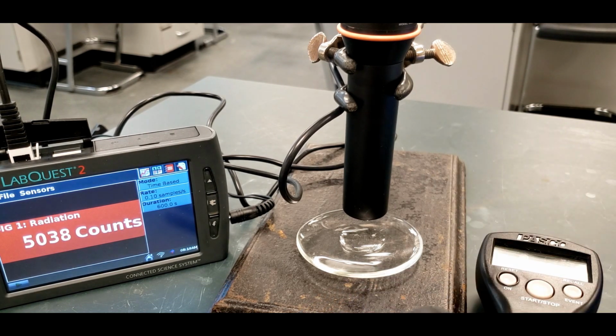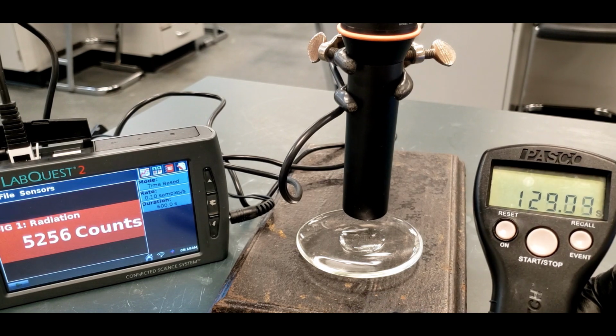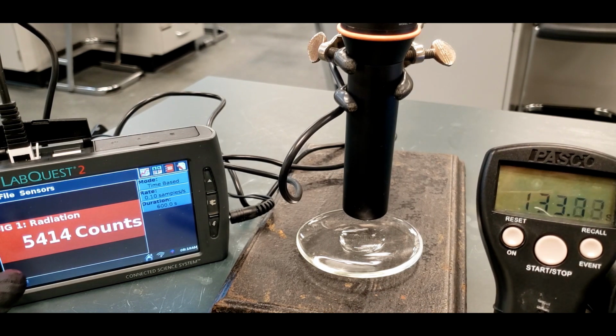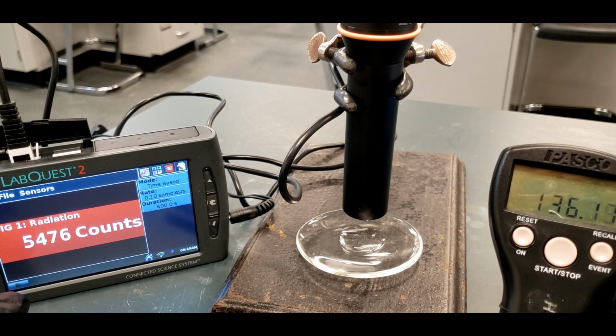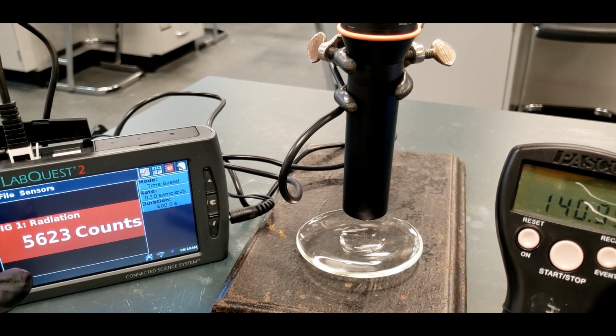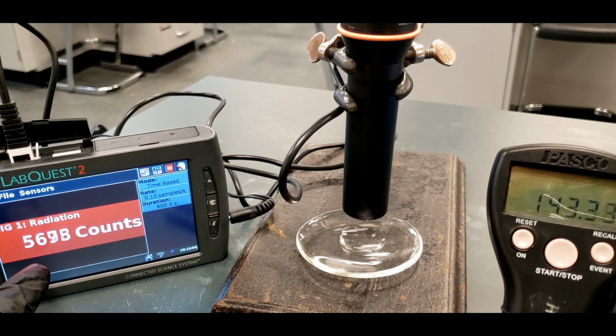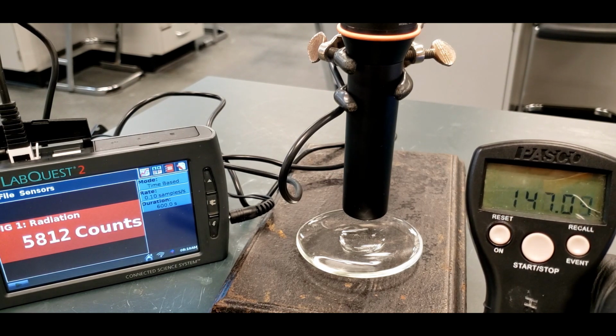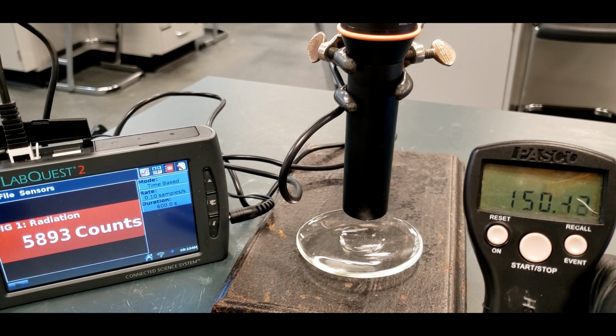So I'll say 5,000 for that one. Okay. And just so you can see, it was 2,800, then 5,000. So if it had stayed steady, it would have been 5,600, but you can see it's already dropping. This number here, that's where it should have been, but it's slowing down like it should. And the half-life is under 3 minutes, so we should see a really noticeable drop each time.